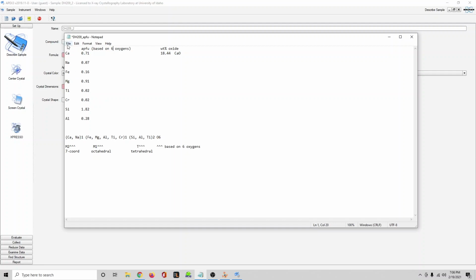In fact, all we really need to know is some of the major elements in it. We couldn't really resolve between titanium and chromium in the structure, but we can actually refine some of these other things to match what we analyzed chemically. But knowing the structure gives you the basis if you're doing this type of mineralogical study.